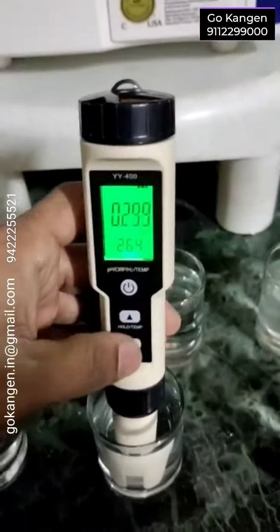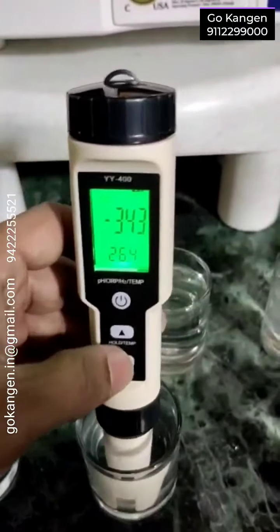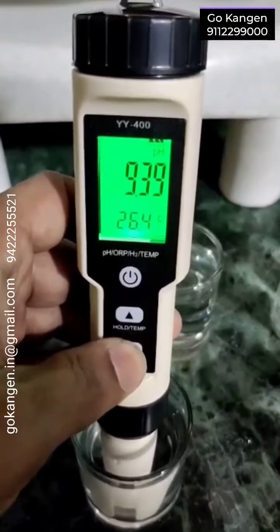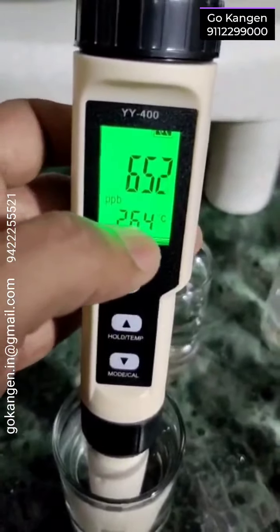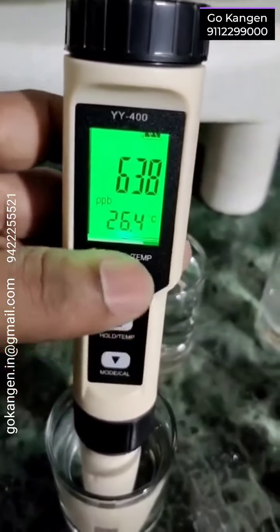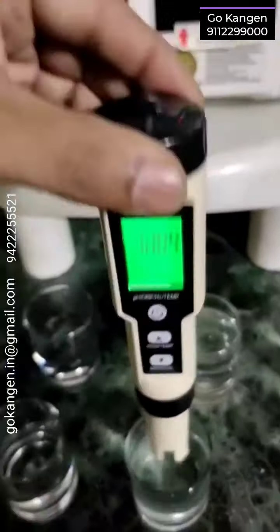Let me show once again. This is ORP. This is pH. This is hydrogen. Temperature is always there. Let's enjoy this YY400. Thank you so much.